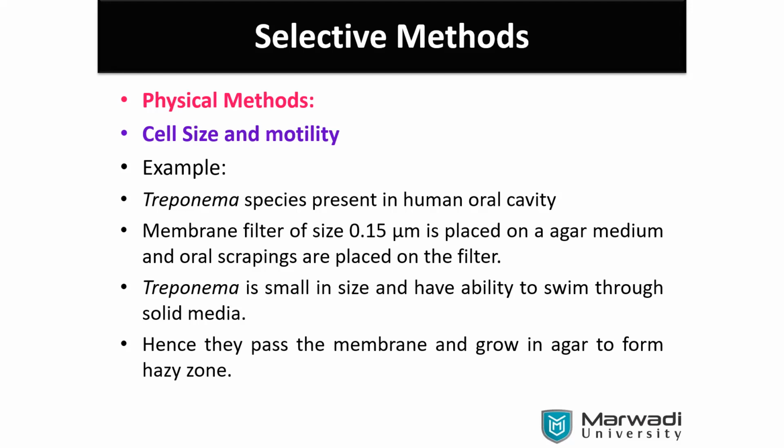Even here, some basic experimentation related to hanging drop is sperm collection, from human or from animal. Those who work in path labs, sperm banks, or IVF-related activities, the first major check is done related to sperm motility.